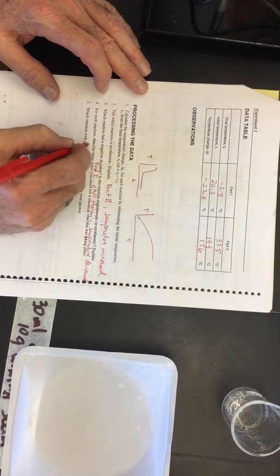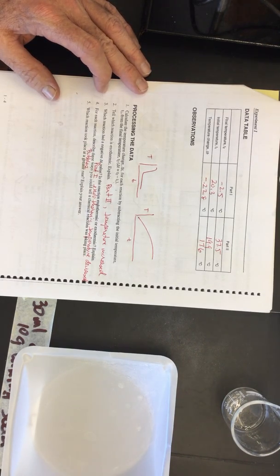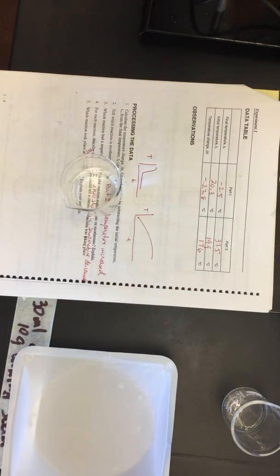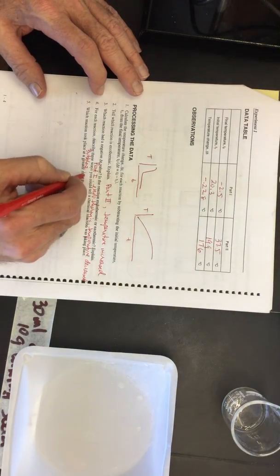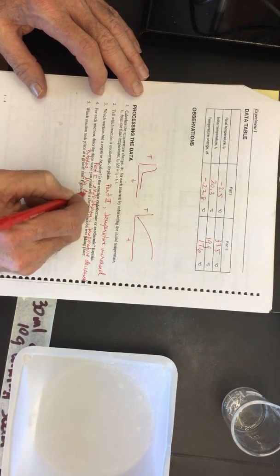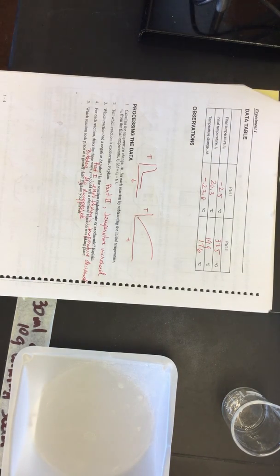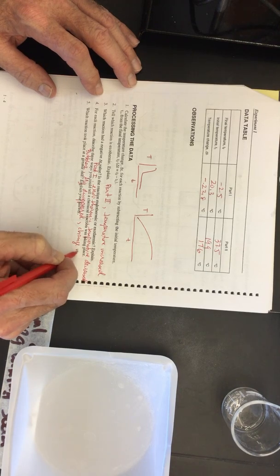So chemical reactions. This is from last semester. Bubbles is an indication that a chemical reaction is taking place. What happened to the magnesium? We can tell a chemical reaction has taken place if there is a visual change and the magnesium disappeared. Those are some pieces of evidence that a chemical reaction took place. Also, a change in temperature. Change in temperature is an indication.